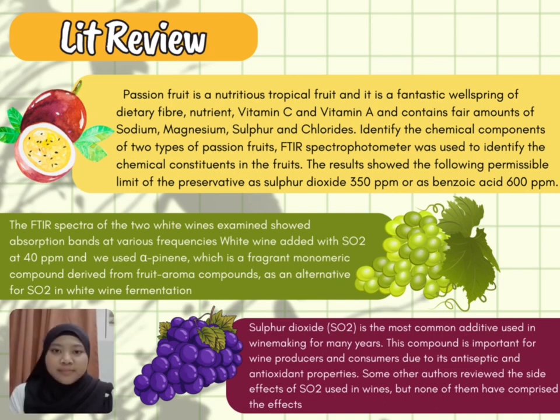Next, the FTIR spectra of two white wines were examined and show absorption bands at various frequencies. The white wine had added SO2 at 40 ppm, and they used a-pinene, which is a fragrant monomeric compound derived from fruit aroma compounds, as an alternative for SO2 in white wine fermentation.